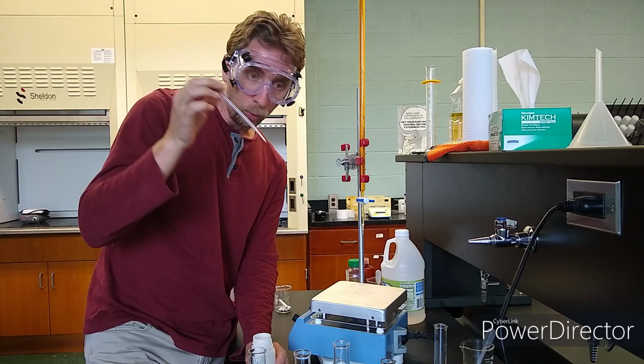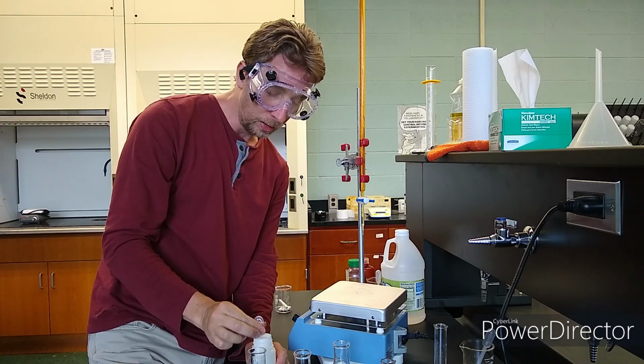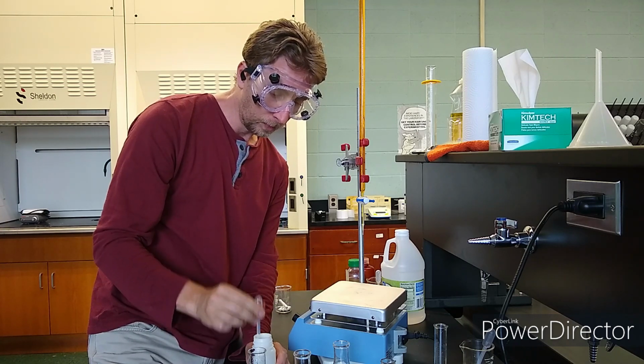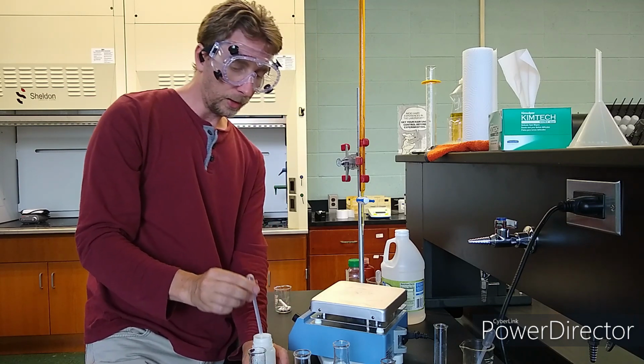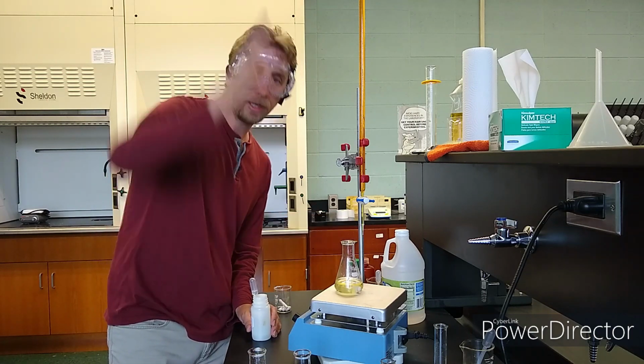So I'm going to just add 1 squirt, and I'm going to make the squirts the same in each of these. Ready? 1 squirt. 1 squirt. And I don't even know if y'all can see this, can you? Can y'all see this? Raise your hand if you can see this.